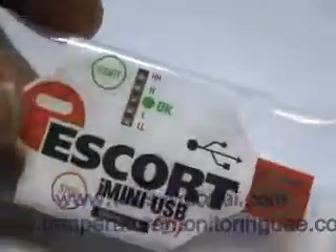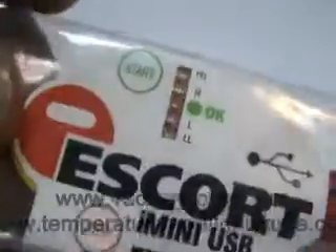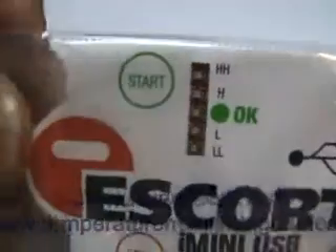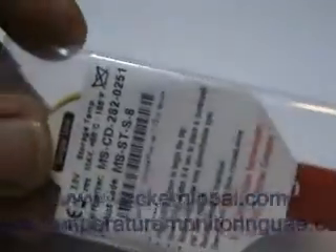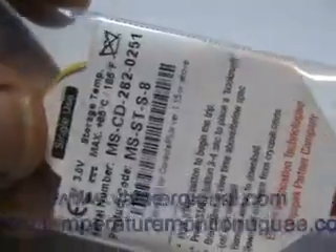This is the USB type temperature data logger. There are buttons to start and stop recording of the temperature. There are five LEDs to indicate whether it has exceeded the programmed levels during the recording. Each USB has its own serial number which is traceable.